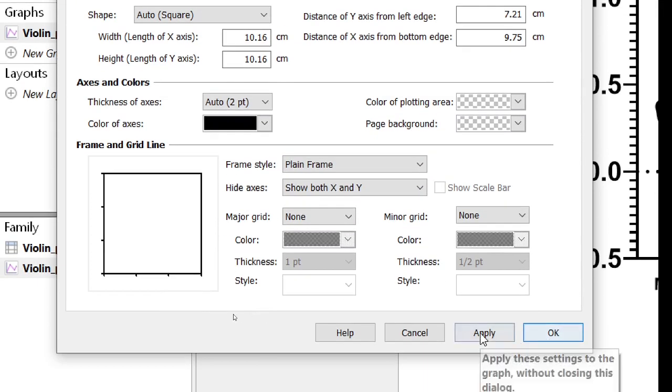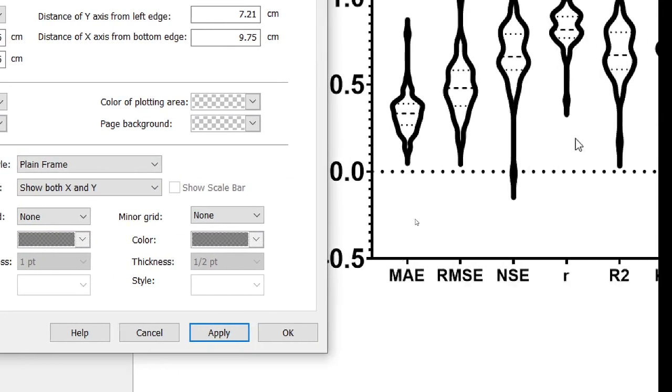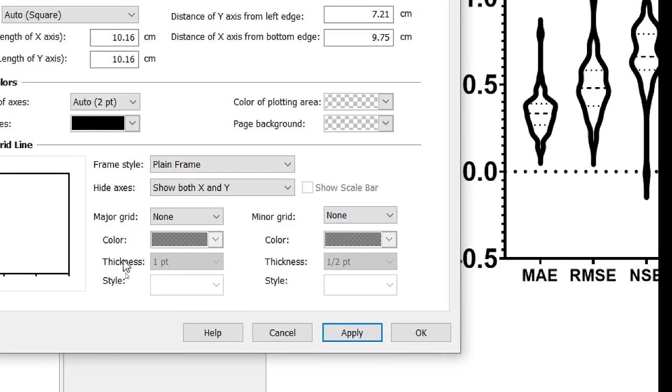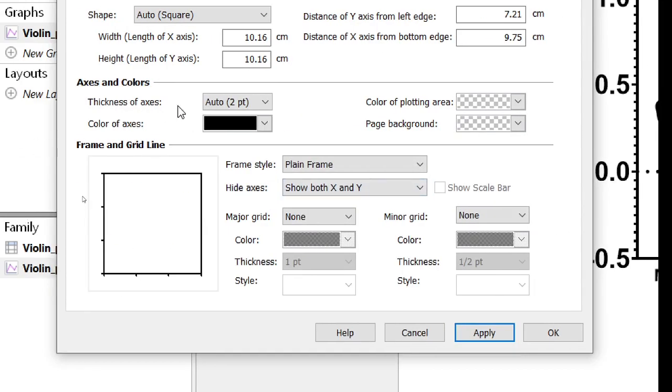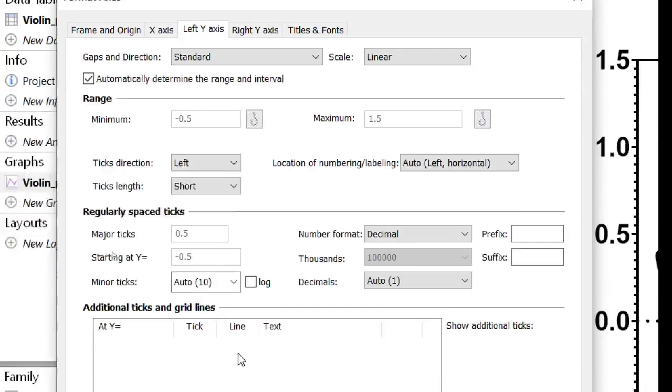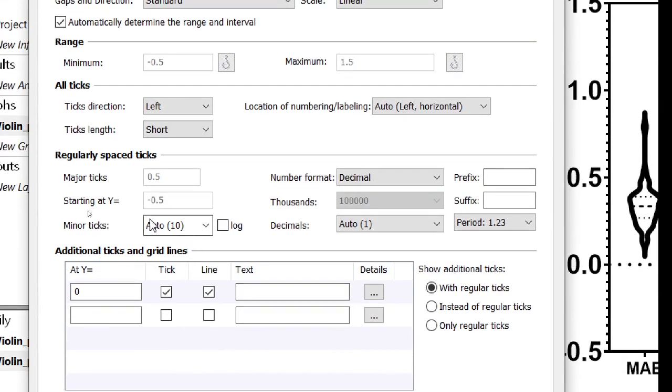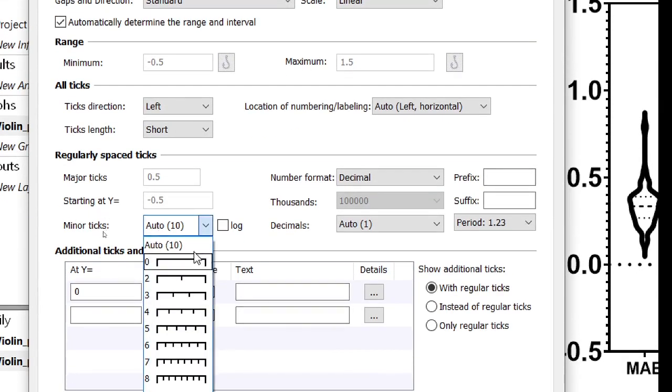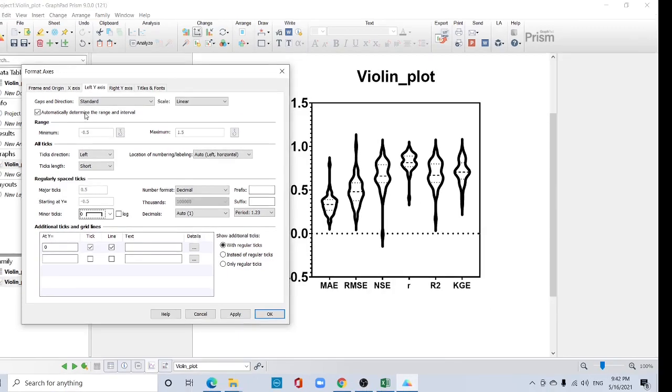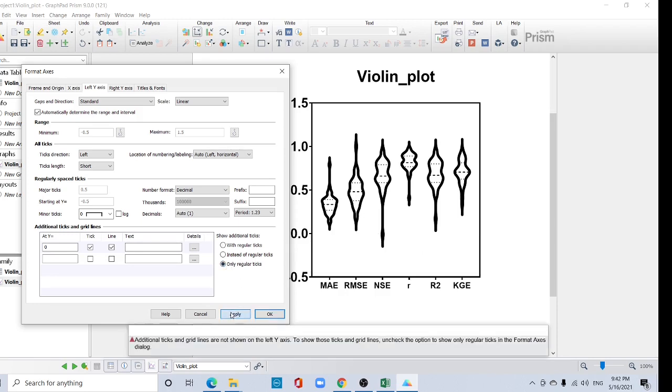I want to also remove this minor grid line. Here the minor grid size Y axis. This is left Y axis and minor grid size. That means you have to select zero in the left Y axis minor grid zero and apply. Okay, now if you want to remove this line, you can just select only regular and apply.